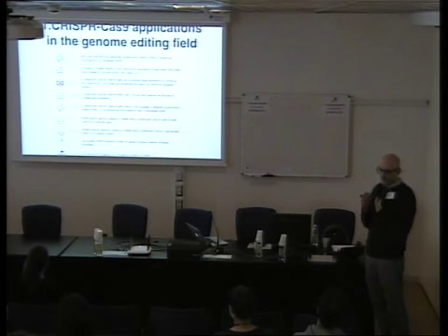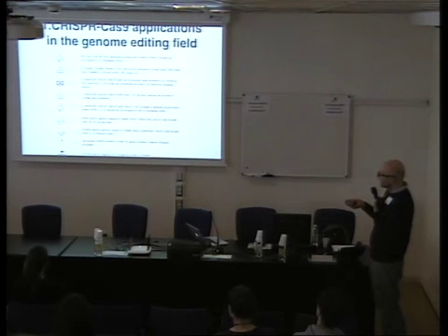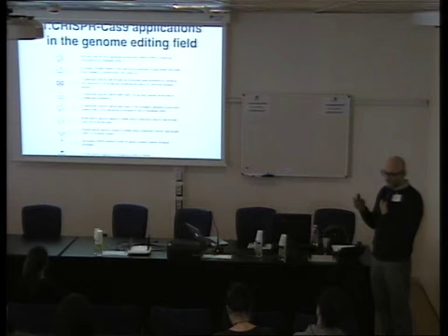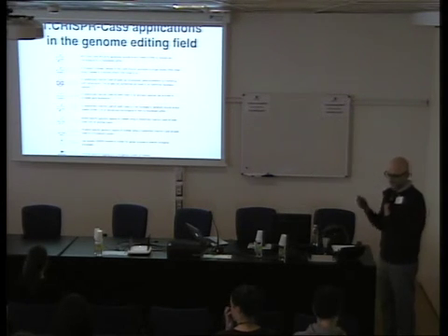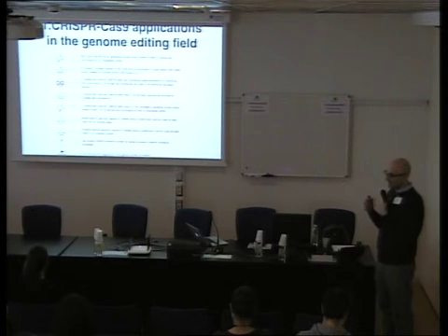But instead of using an antibody, you use the Cas9 system. Or you can visualize, sort of FISH. Instead of using a probe made of DNA or RNA, you use the protein with the guide RNA attached. You can screen or you can tag.